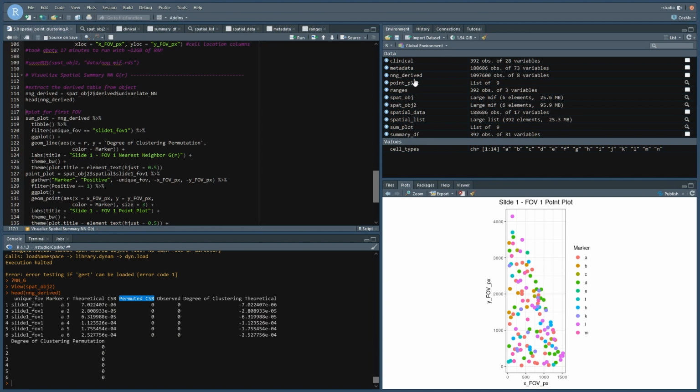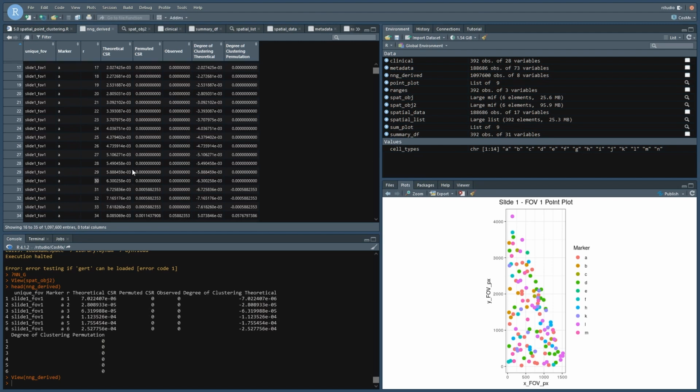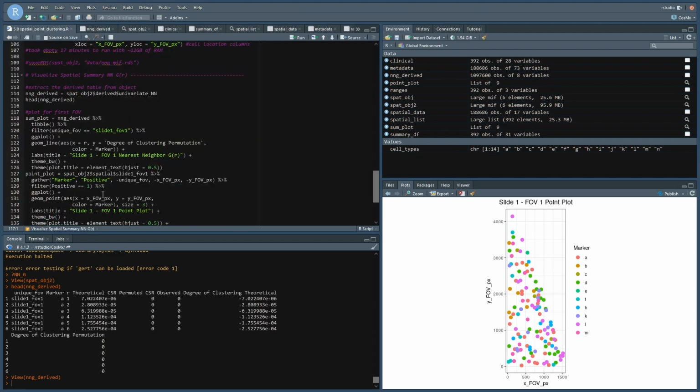Around that cell, you're not going to have any positive cells within 2R of it, right? So if we go here, we can see 34. The nearest two cells that we have, it's actually here, 31, we'll call it 30. The nearest two cells that we have possibly a radius of 15, so 2R. So there's nothing any closer than 30.